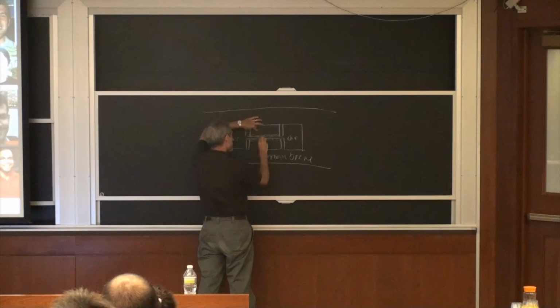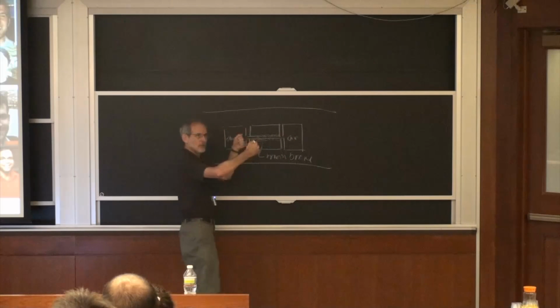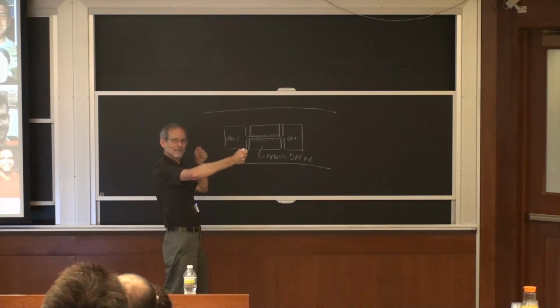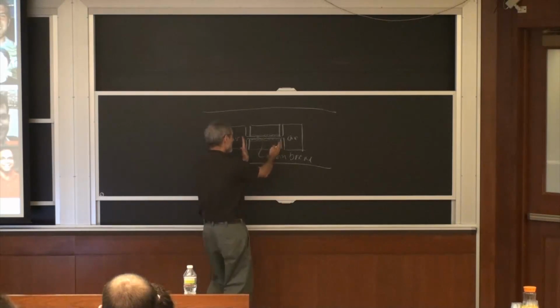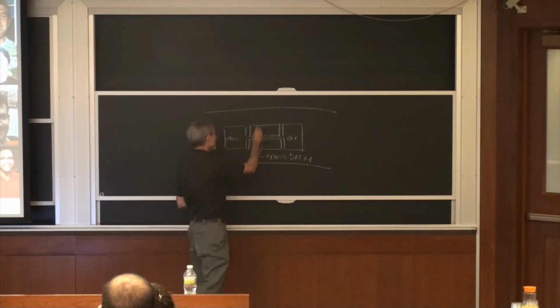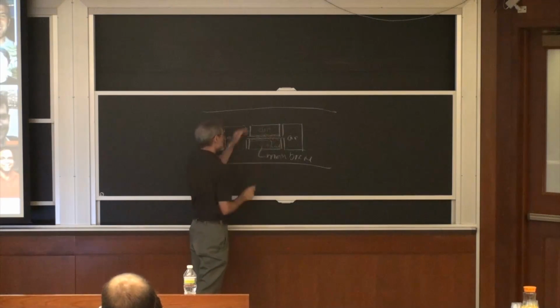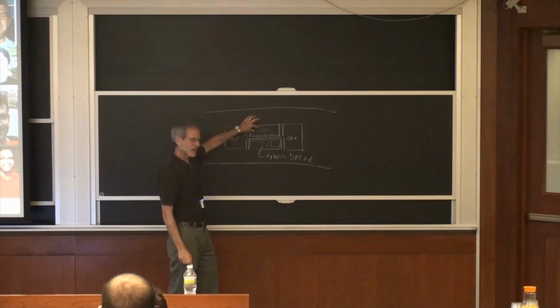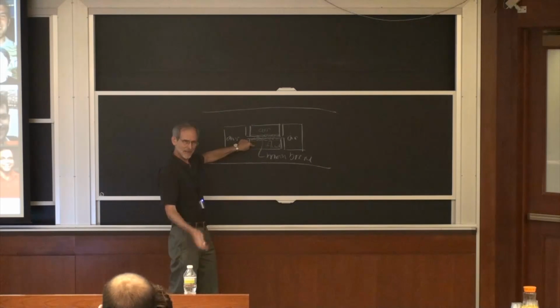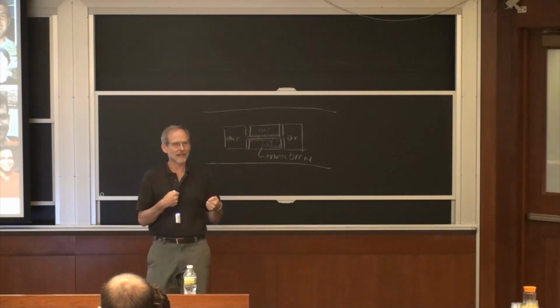This membrane was porous, and by changing the air pressure here, you could periodically stretch the membrane. This was on the order of about millimeter scale. They would have fluid down here and air up here. So this would represent the gas portion of the lung, and this would represent the blood supply, the capillaries in the lung. So there are ways of putting that in.